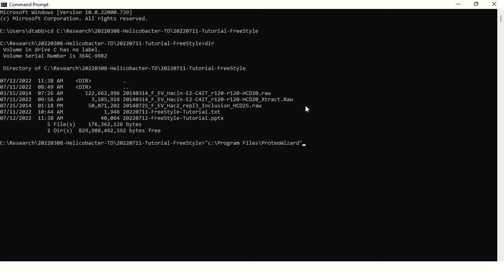I type PRO, I hit tab, and it says there's a subdirectory that starts with PRO. It's called ProteoWizard. Inside ProteoWizard, I have another directory with the specific version number, because some computers have multiple versions of ProteoWizard installed. And then inside that, I want to call Thermo Raw, and I can't remember the rest of the name, so I hit tab: Thermo Raw Meta Dump exe.